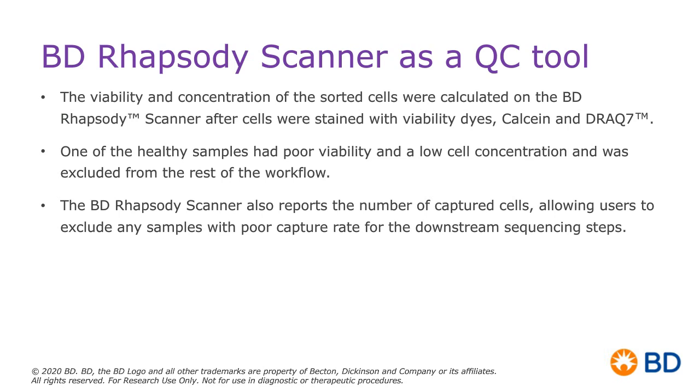You may have noted, I did point it out earlier, we did start out with 4 healthy controls and 4 CLLs, but moving forward, we decided to focus on only our high viability good samples, which is now down to 3 healthy controls and 4 CLL samples.